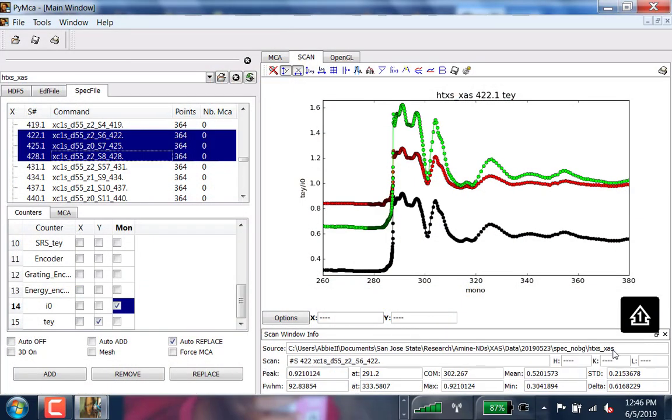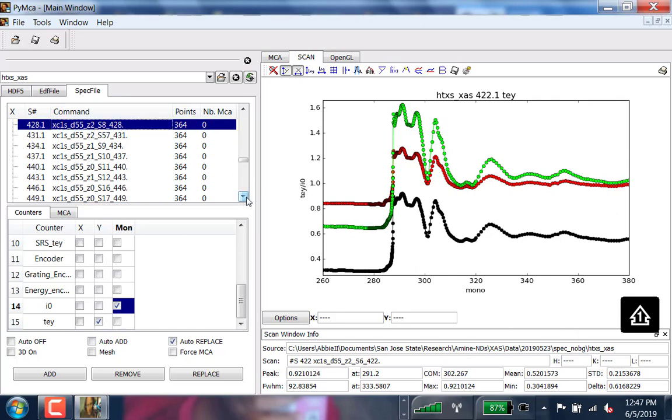For today's work, I think we should really focus on the carbon and the boron scans, since we've got Team Boron in the house. And that includes a whole series of scans which are starting at S39, I believe. So let's go down and identify where our S39 begins. So let's see, S38. That's BCL3, 3 hours, 321.19. Let's get to that guy.